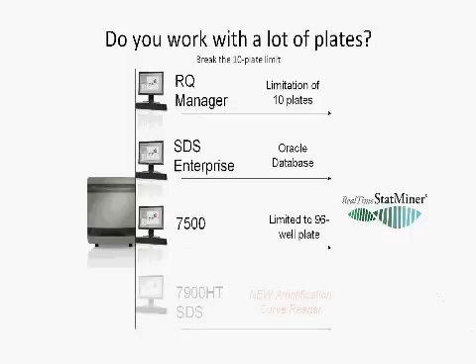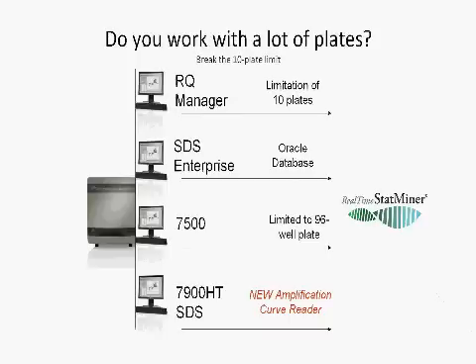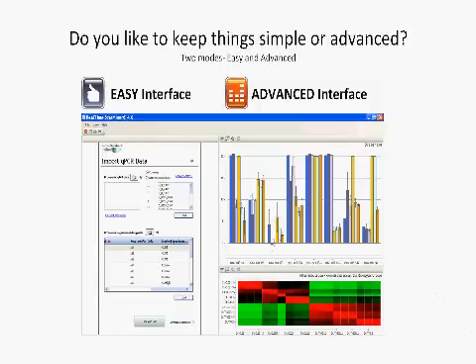So, if you're familiar with RQ Manager and SDS software, you'll know that you can export 10 plates at a time. Now, with our latest release 4.1, there's no limit to how many plates you could upload using the new amplification curve reader. So if you're interested in uploading multiple plates, you can go ahead and use the amplification curve reader.